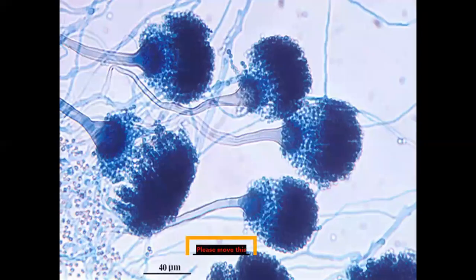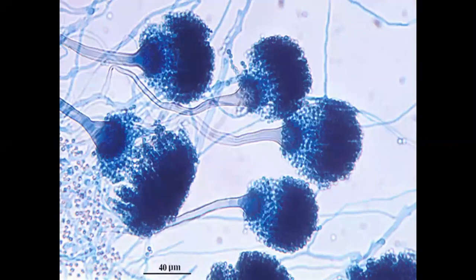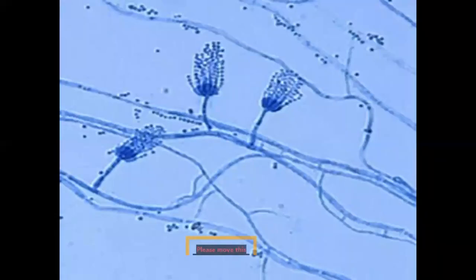In Aspergillus, the conidia are in the form of a ball or a Japanese or a Chinese fan. But in case of Penicillium, many conidia are attached perpendicular to the tip. So this is Penicillium. This is Aspergillus.